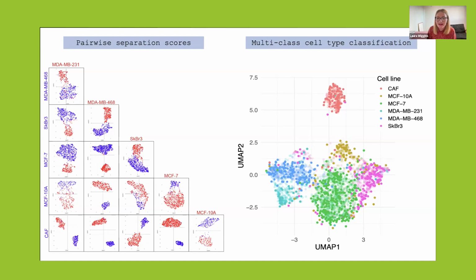And interestingly, although you can see the colours are reflective of cell line, there's also 3 main clusters that you can see there too. And they're separating cells out into mesenchymal cells, which is your turquoise and blue there. You've also got epithelial cells, which are your green, yellow, and magenta. And then you've also got fibroblast cells, which are in red. So it's actually showing that Selfie can separate out distinct cell lines, but can also separate out into mesenchymal properties, epithelial, and fibroblastic too.